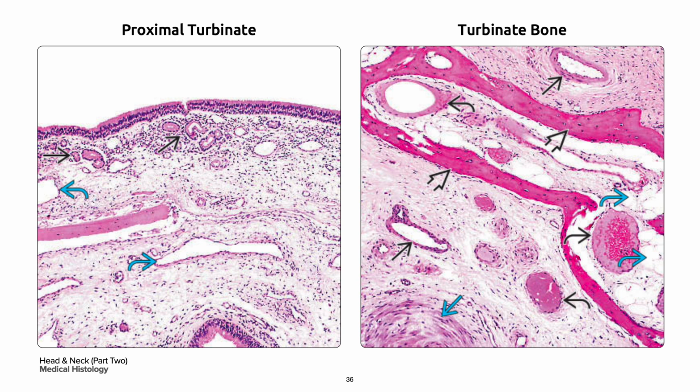On your left is the turbinate stalk that has a thinner lamina propria with fewer vessels in a curved blue arrow and salivary glands in a single black arrow. The epithelium has fewer mucous cells as well.